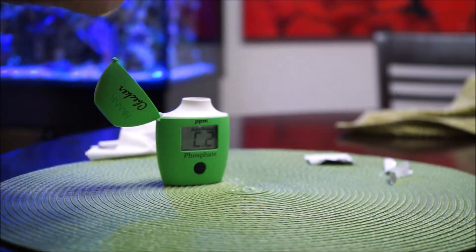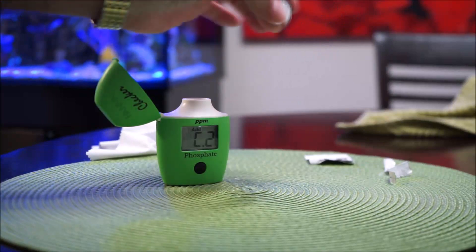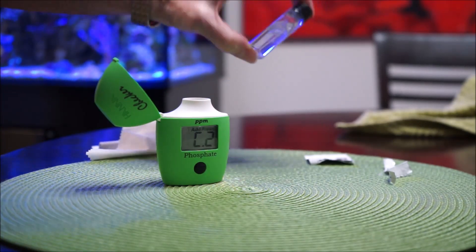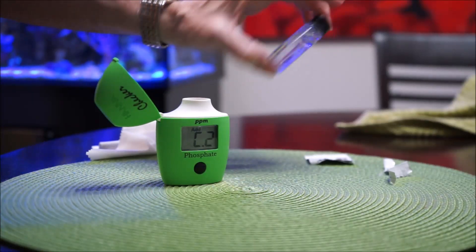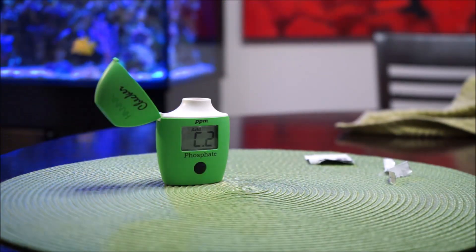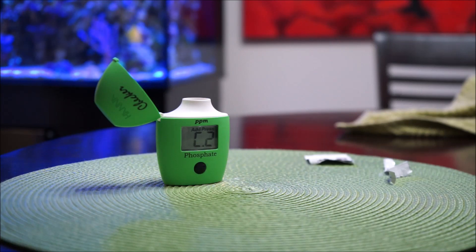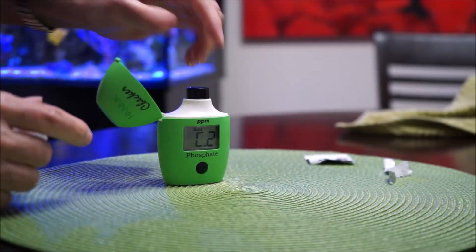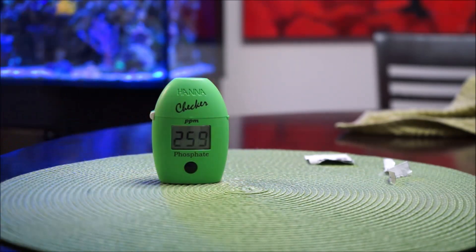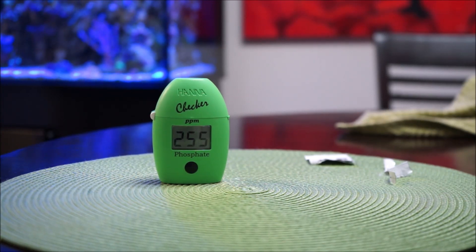The instructions say to shake it for a minute and a half, but you really don't have to go the full time. Just keep shaking it, and when you hold it up against the light and see no particles of the powder remaining, you're good to go. While it's still on C2, clean the vial again to remove fingerprints, put it inside, close it, and press the button again. Now it's going to start counting down three minutes.